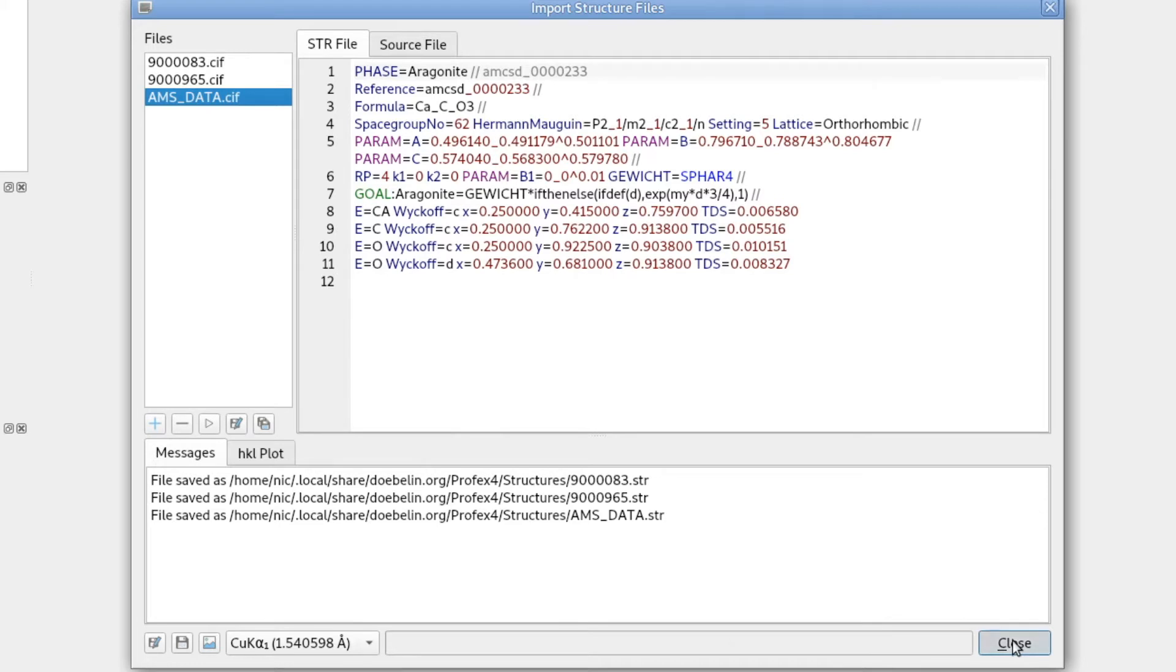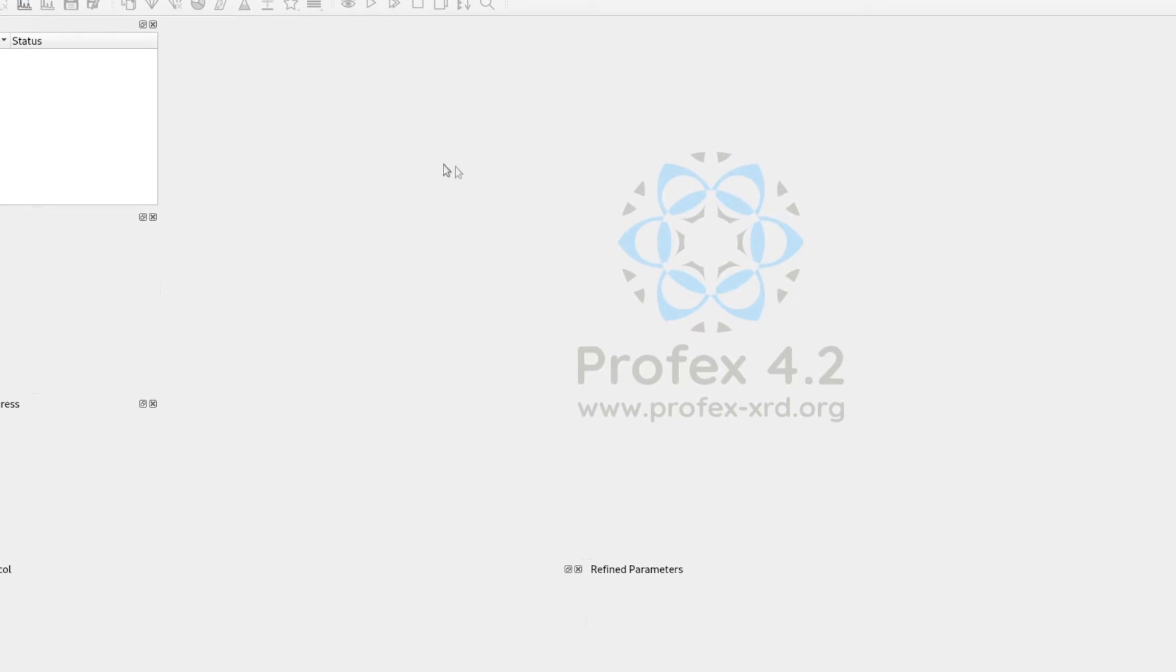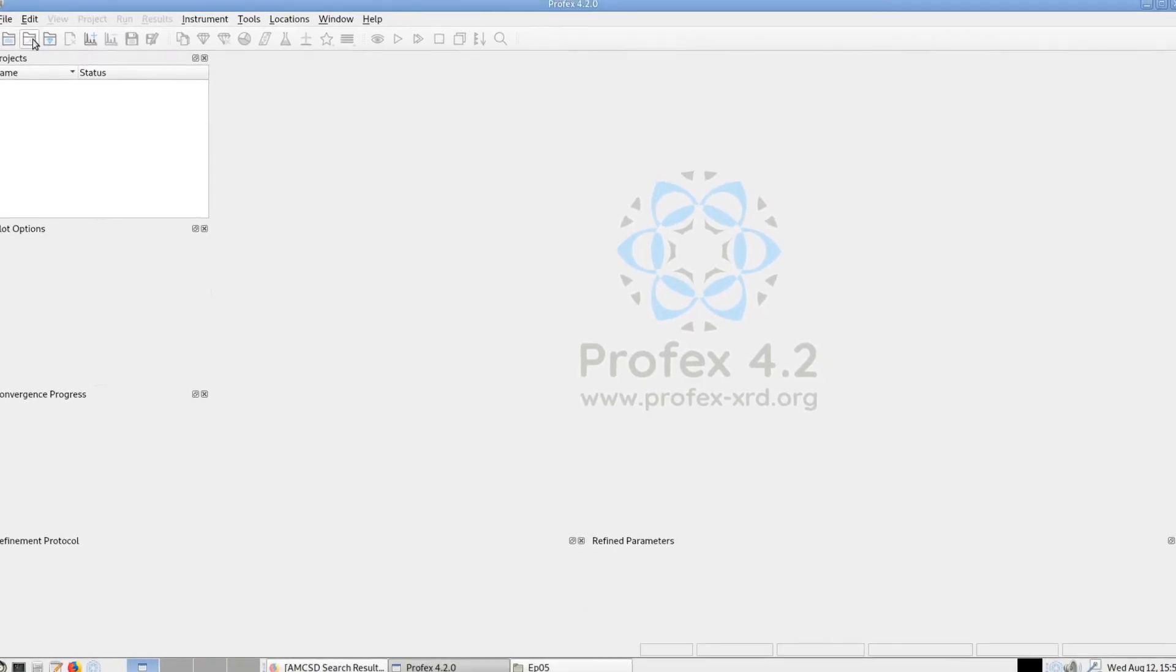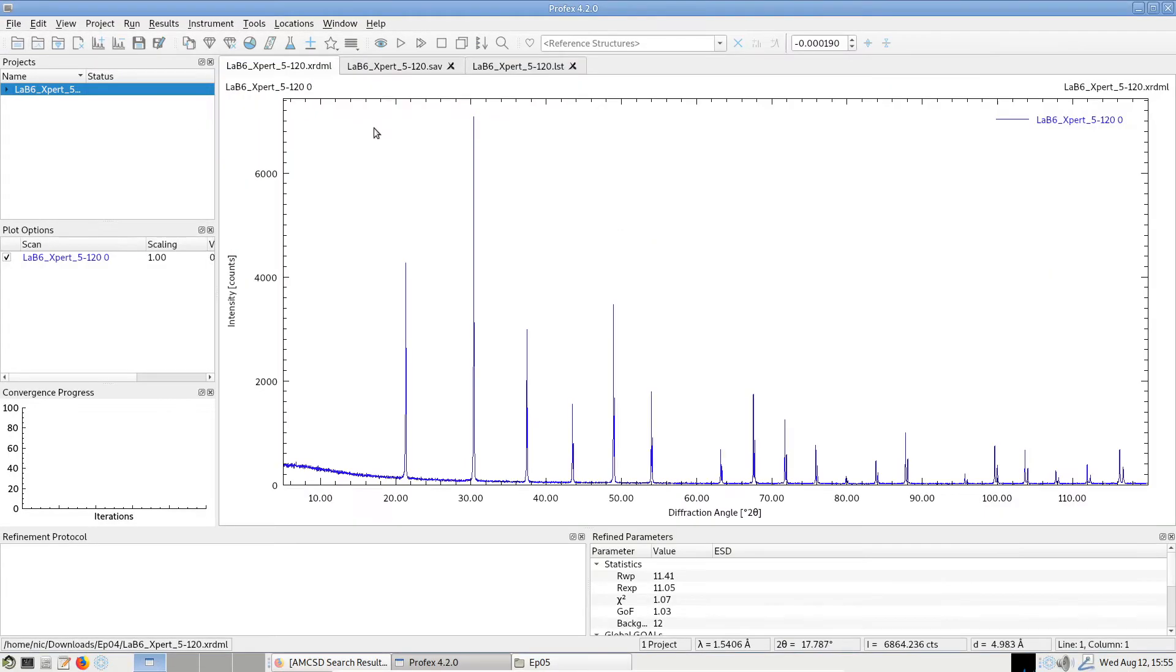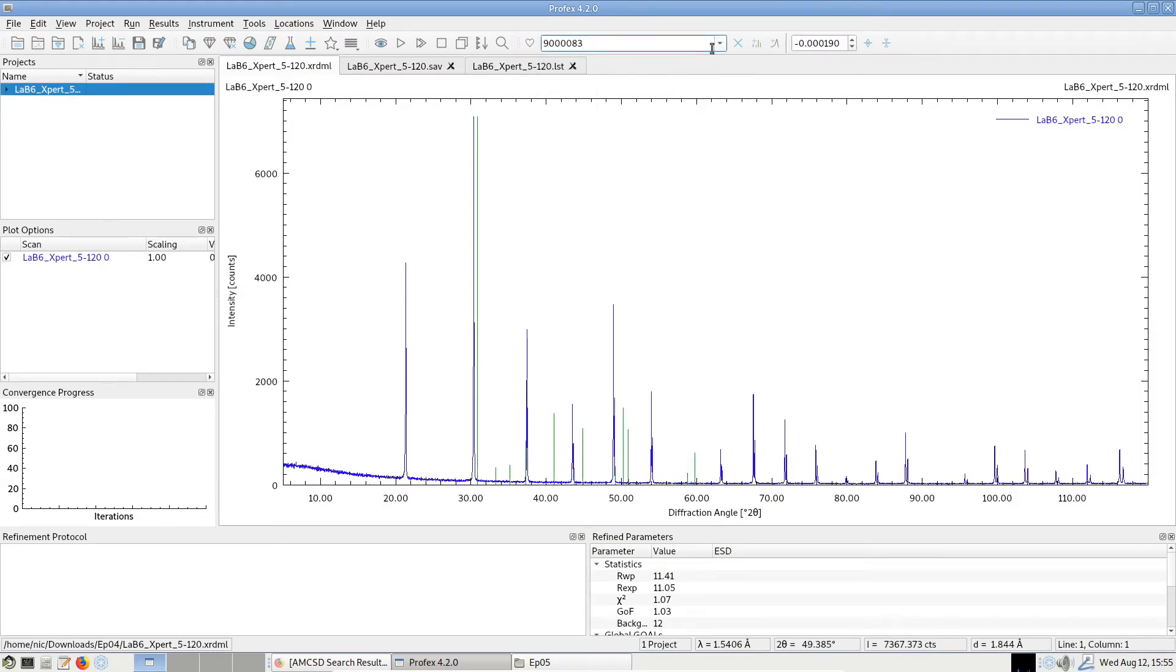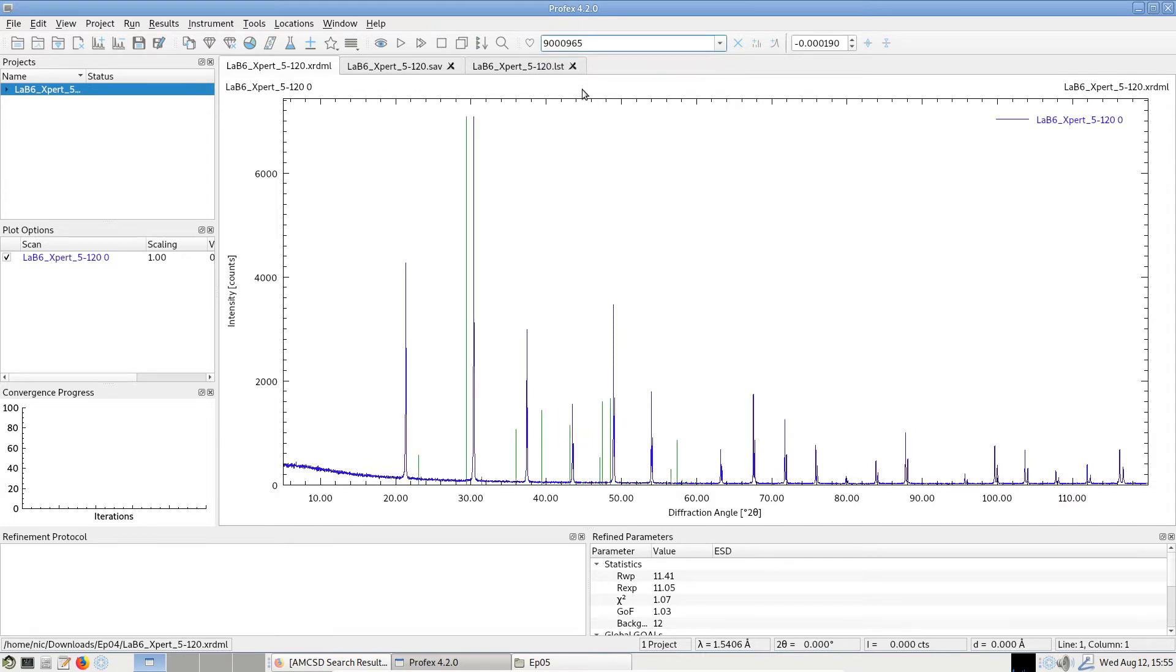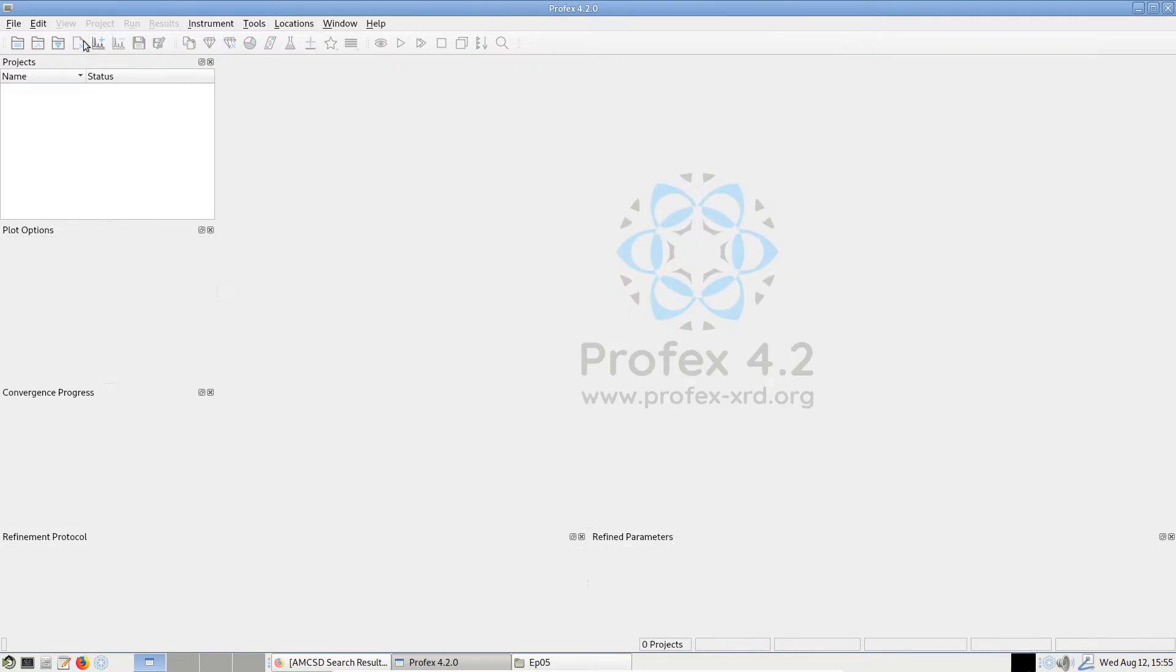If we close the dialog, it will run indexing of these files. So now they should be available in all of our new projects. We can actually see them here right at the beginning because they start with numbers instead of letters. So this is ideally what happens - we only have to load the files, run verification, and then save the files to the repositories.